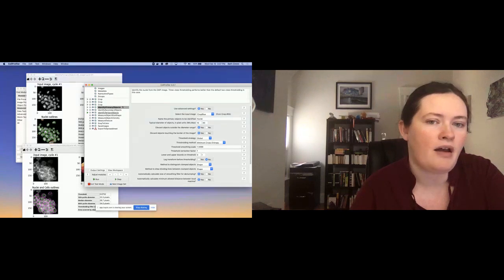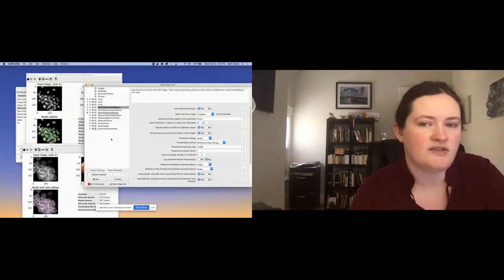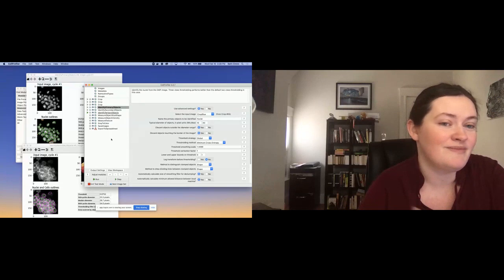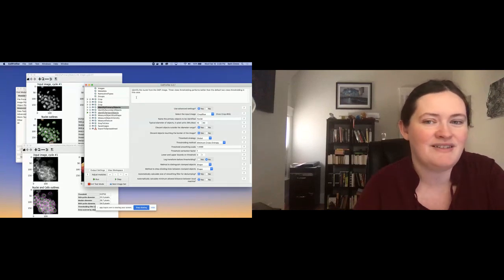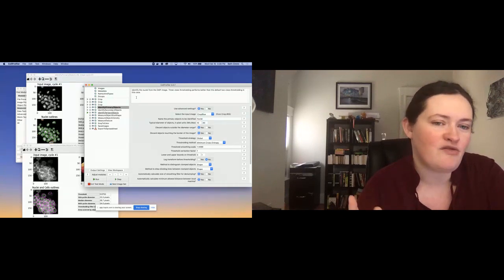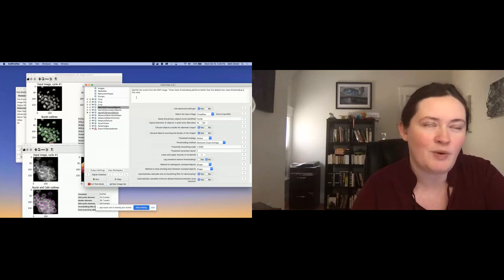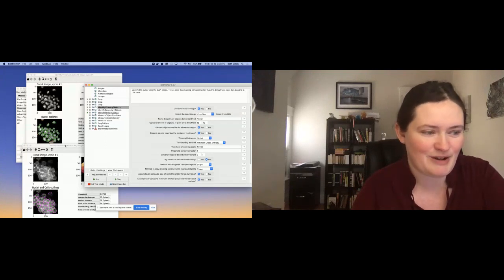But all of the things that are in the main program are conventional segmentation where you do a thresholding and then a watershed. And that's simply because at this point, deep learning based models, while we think they're really powerful and we think 5 years from now they might essentially be everything that's in CellProfiler, they're really difficult to package right now. And we want this to work on everybody's computer, whether they have access to a top of the line GPU or whether more likely they're using the 8-year-old lab computer that's in the back next to the microscope.